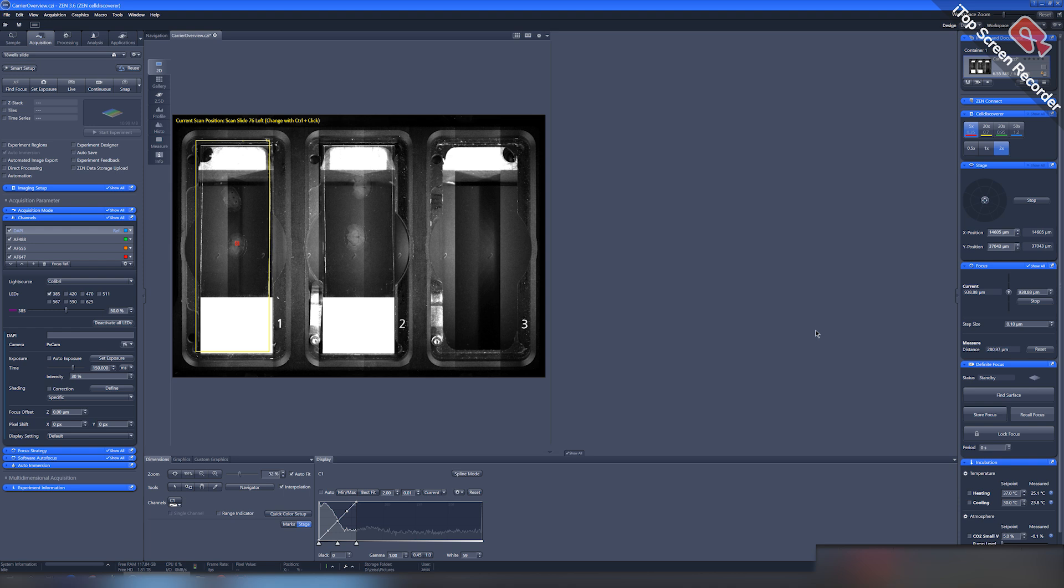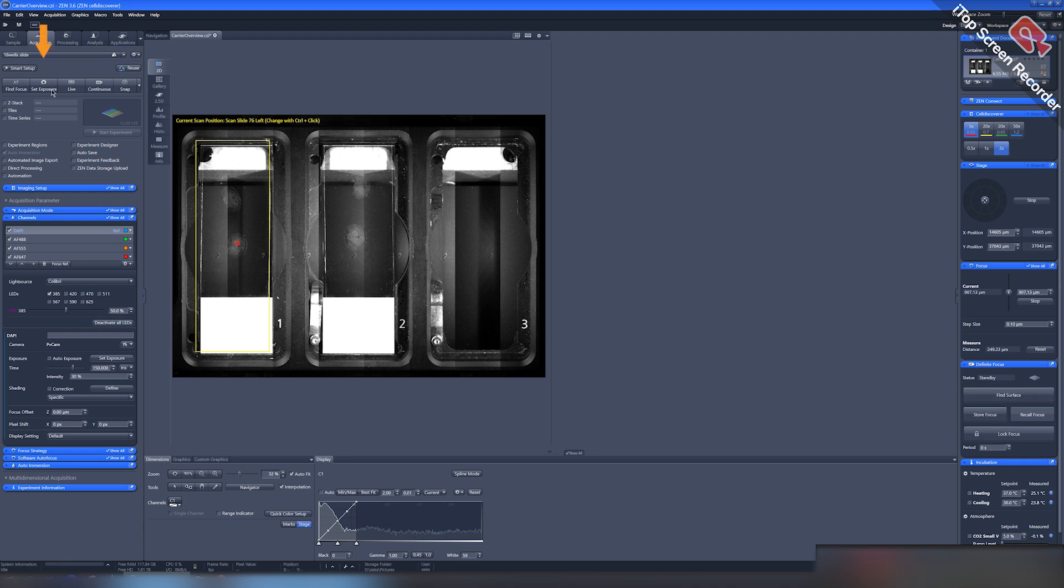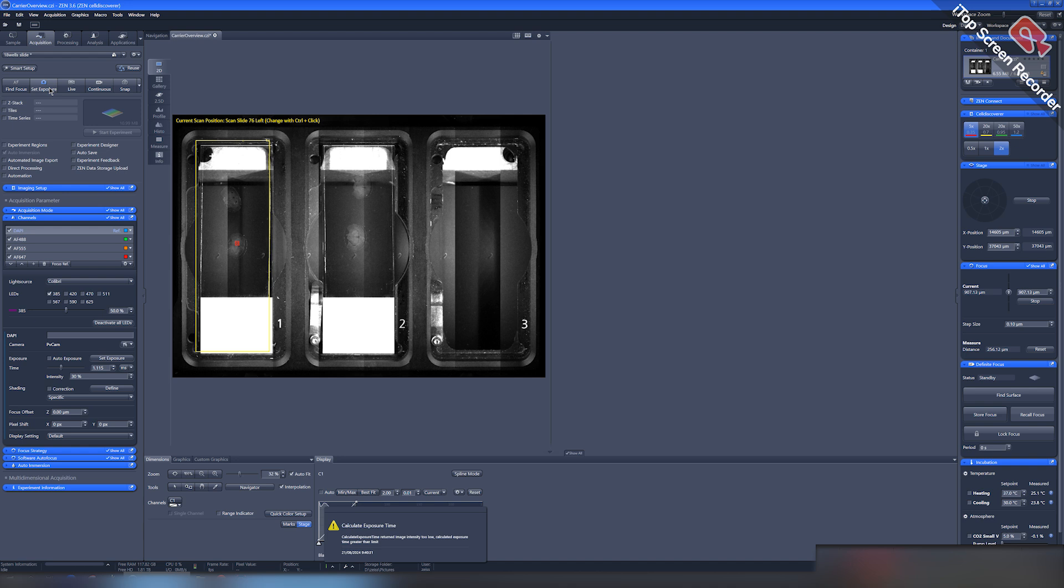Then we need to focus and set the exposure. For coarse focusing, press the Find Surface button in the center right and the Set Exposure button in the upper left part of the workspace.